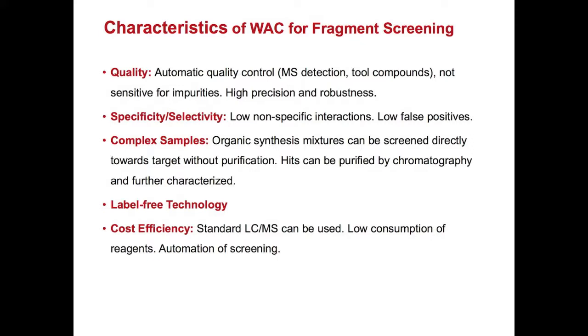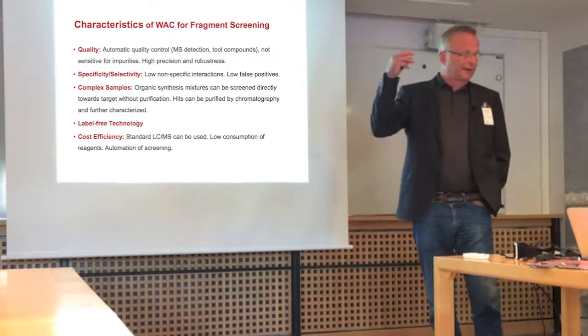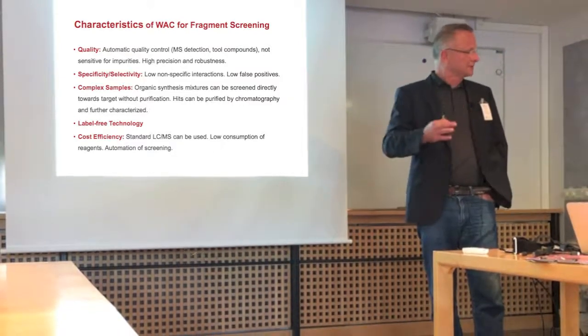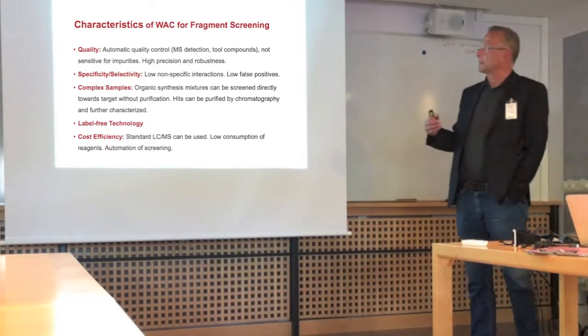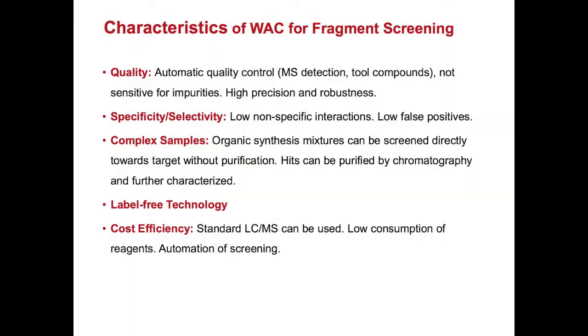Complex samples. I think this is something that can really be valuable for the future. We can work with complex samples. We can purify them. We can characterize them, like I did with the bitter gourd here. Right now, I'm characterizing binders to these targets with all methods because we can just fractionate and go to NMR, high resolution MS, and so on, to do further characterization of it. It's label free. And we think it's quite cost efficient. Here you can do it with something which you already maybe have.